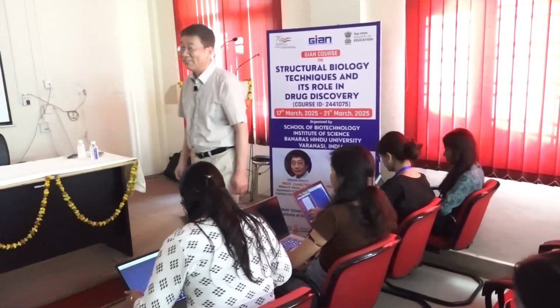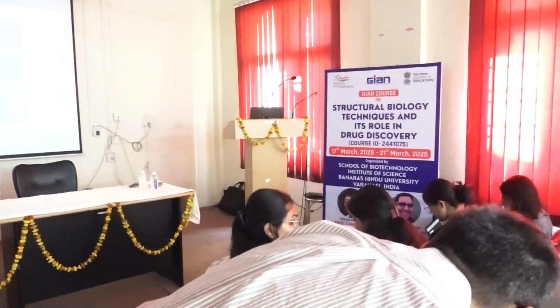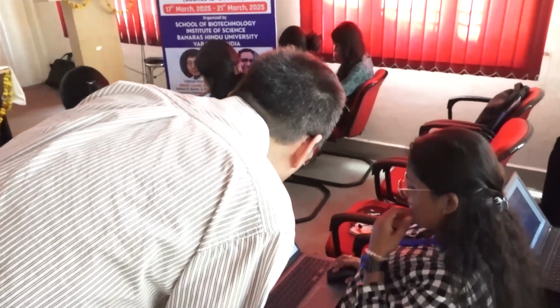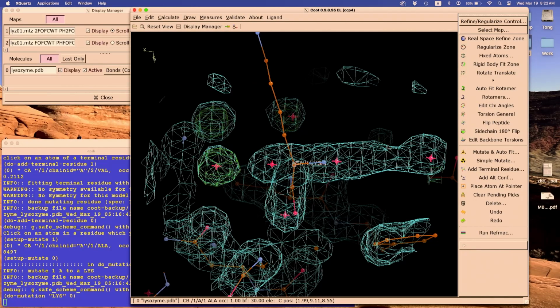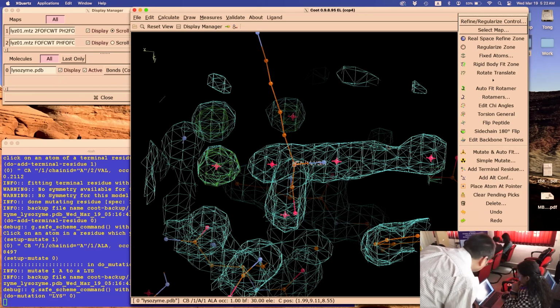No? All right. Add terminal residue and shift. But so go here. Here. And then chain, open this, and then click on 2. There you go. Say accept. Apply. Yeah, you're there.